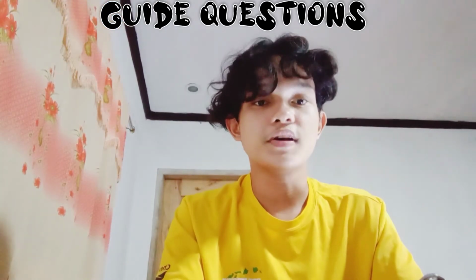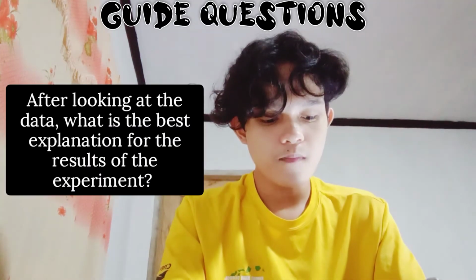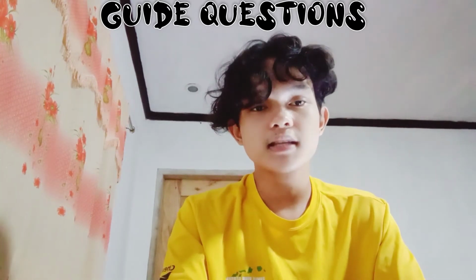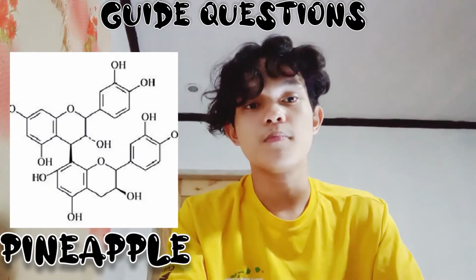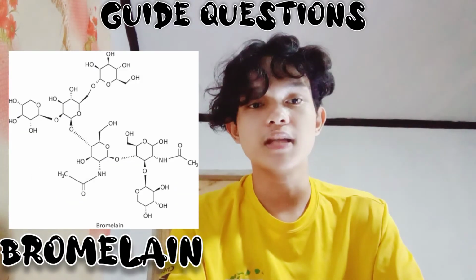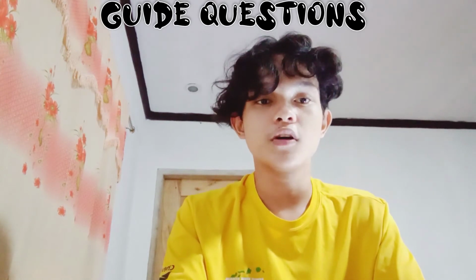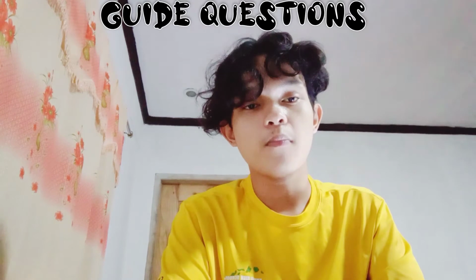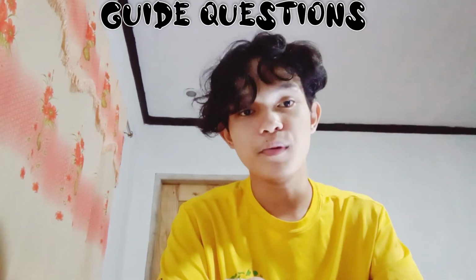And for the last question, after looking at the data, what is the best explanation for the results of the experiment? The best explanation is that gelatin reacts to the pineapple because of the bromelain that allows the amino acids from the gelatin to break down. And that results in the liquefied state of the gelatin, while the gelatin without pineapple does not show any response because there's no process happening.